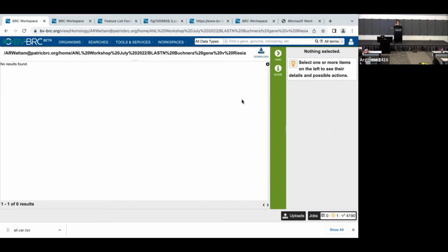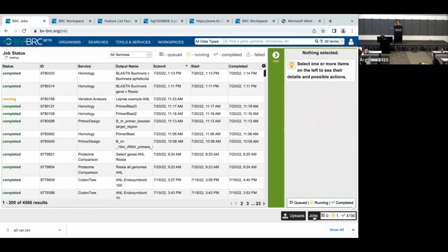And so it says, when I took this Buchnera gene that I saw in the heat map, remember yesterday when we were in the heat map and I showed you how you could collect a series of genes out of that and download it? This was one of those. But because we're trying to move things along at a clip, I didn't go over that. So let's see if my other job is done. And this is just to test if it's true.